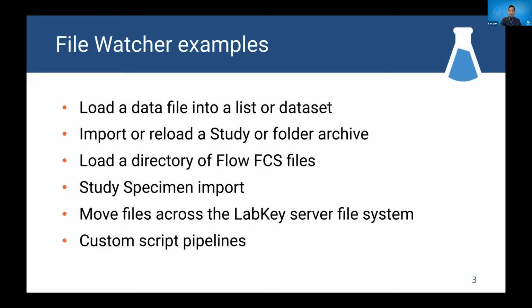Additionally, you can load a folder of FCS files if you have the flow module, and import specimen data into a study specimen repository. The specimen data that you can import could consist of an entire specimen archive, or it can be the individual pieces of a specimen archive, the vial information, or any of the primary, additive, or derivative types.